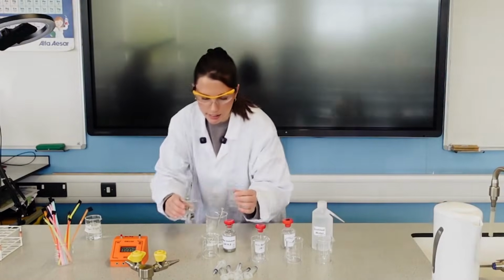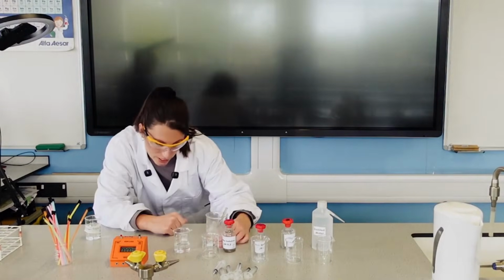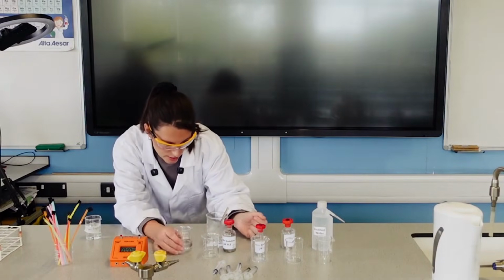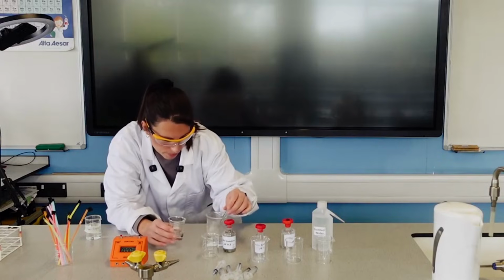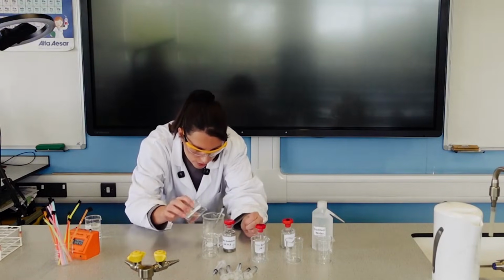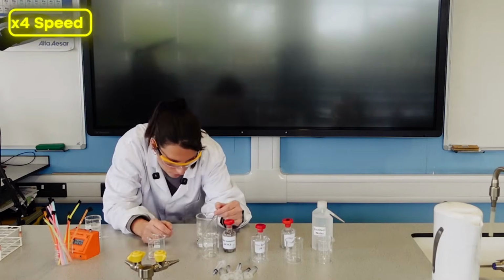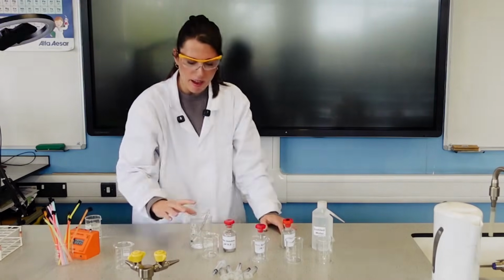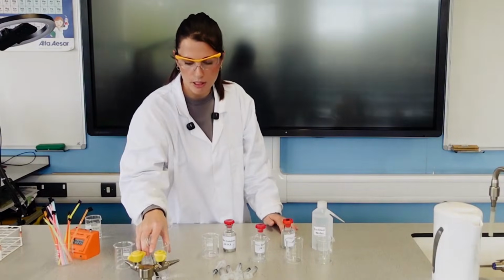So let's have a look at the temperature of this water at the moment. So actually it's not far off because we boiled that quite a long time ago. This is at 50 degrees. So I'm going to add a tiny bit of cold water. Okay, that's gone down to 47. 45. Okay, so that is at about 42, but I'm going to leave it at 42.